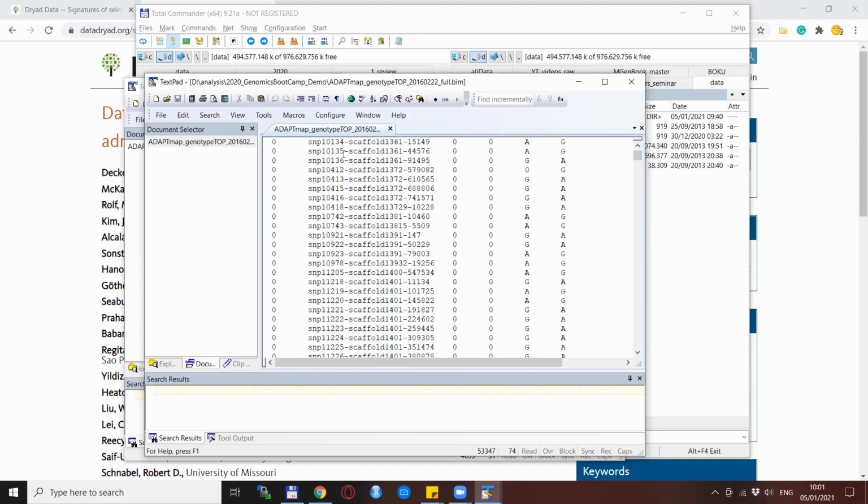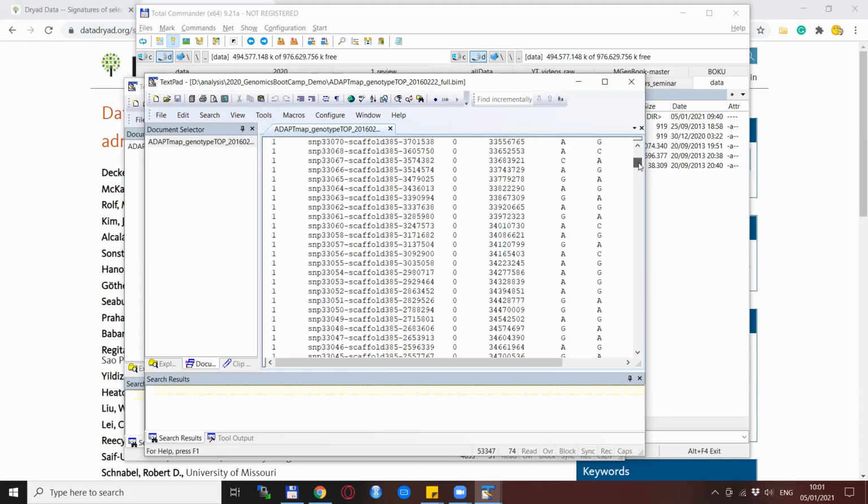That is again unique for each SNP, and it was given by the people who actually designed the SNP chips. The third column is the position of the SNP in Morgans, which is often left as a 0. It's often regarded as uninteresting and therefore zeroed out and skipped. Column 4 is actually the more important one. This is the position of the SNP in base pairs.